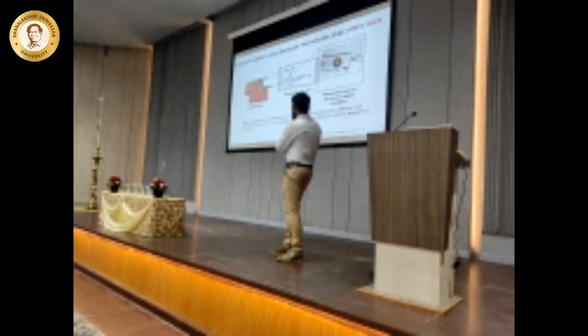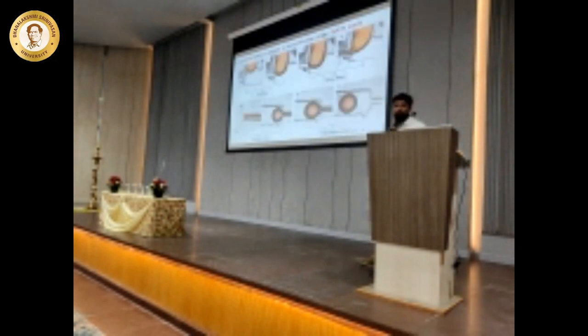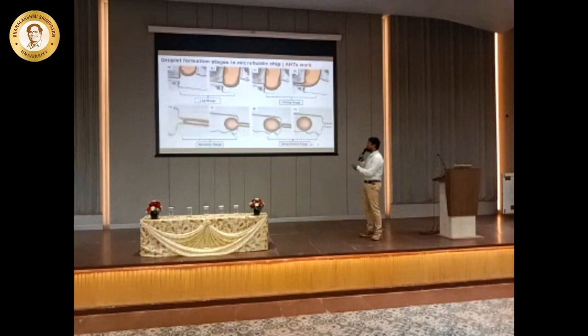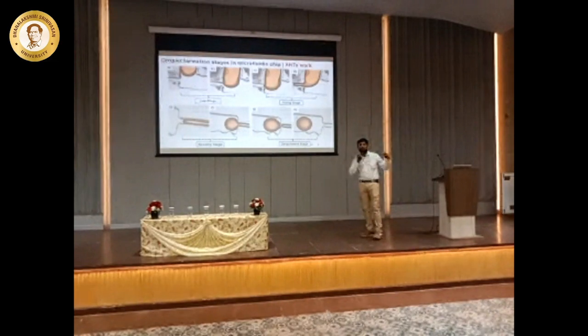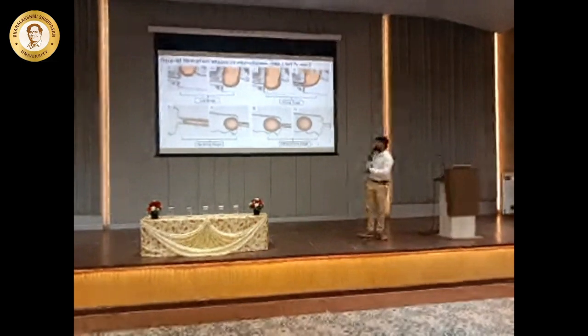So what we have done is we have made a very small design in this, and we have created all these droplets here. We use syringe pumps, and finally we could get the droplet sizes. We have also tuned, and we also understood the different lag phases, and how this necking is happening, how the droplet is created when two fluids are interacting, two immiscible liquids are interacting. So here we have 4 different stages.